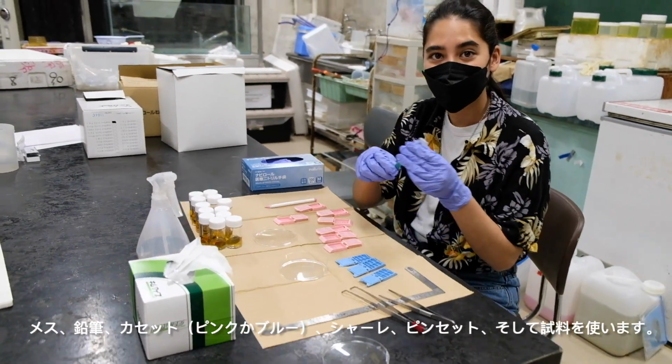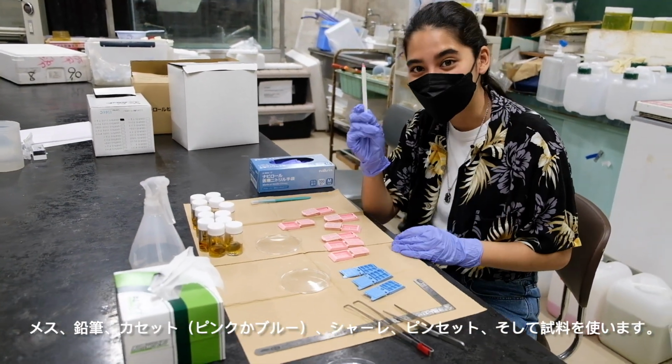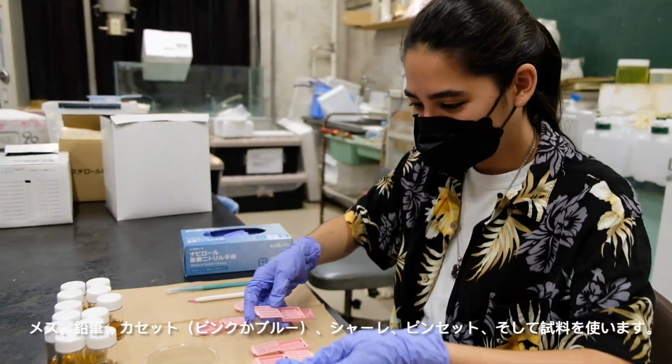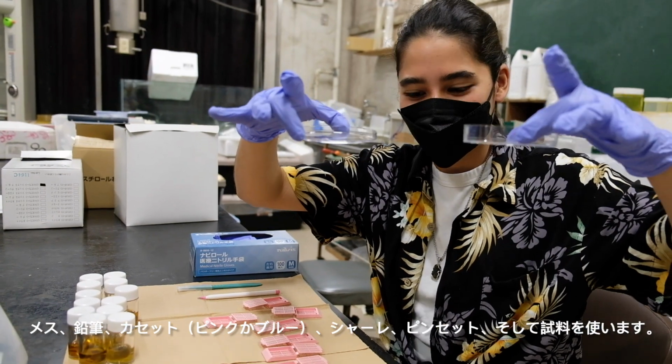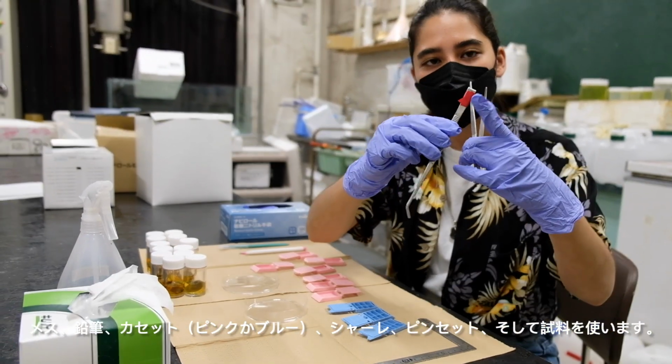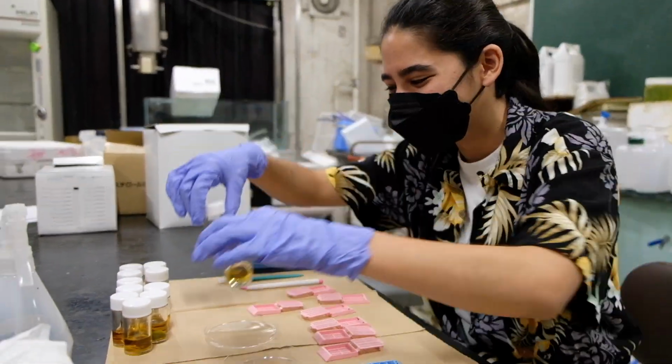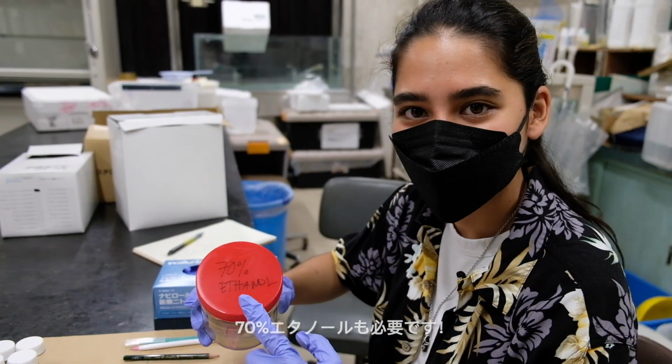So what we'll be needing today is a scalpel, pencil, cassette, one of two types, pink or blue, petri dish, two tweezers, one with the red formalin tape, one without, and your samples. Don't forget your 70% ethanol.